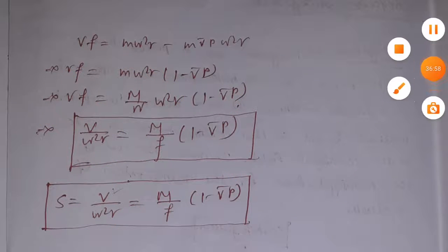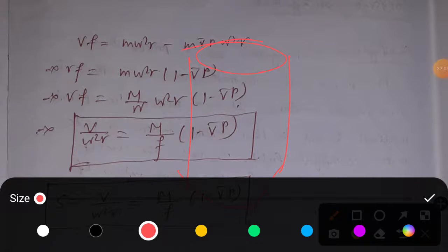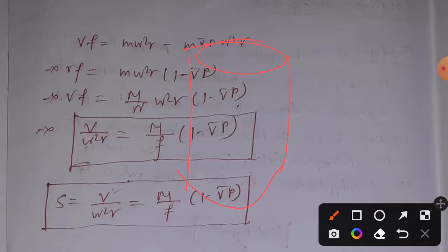What I have explained here is that in the solution, suppose you have a molecule A on which a centrifugal force is working, as you are spinning your tube in a centrifuge. The centrifugal force works downwards, and its value is m omega square r. As the particle occupies some portion of the solution, a buoyancy force will also work in the opposite direction.